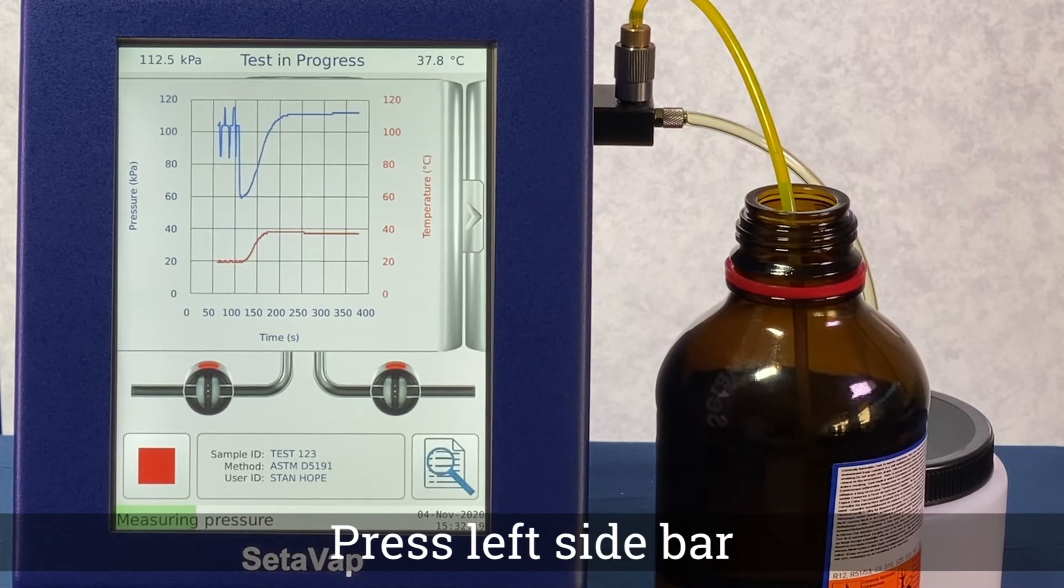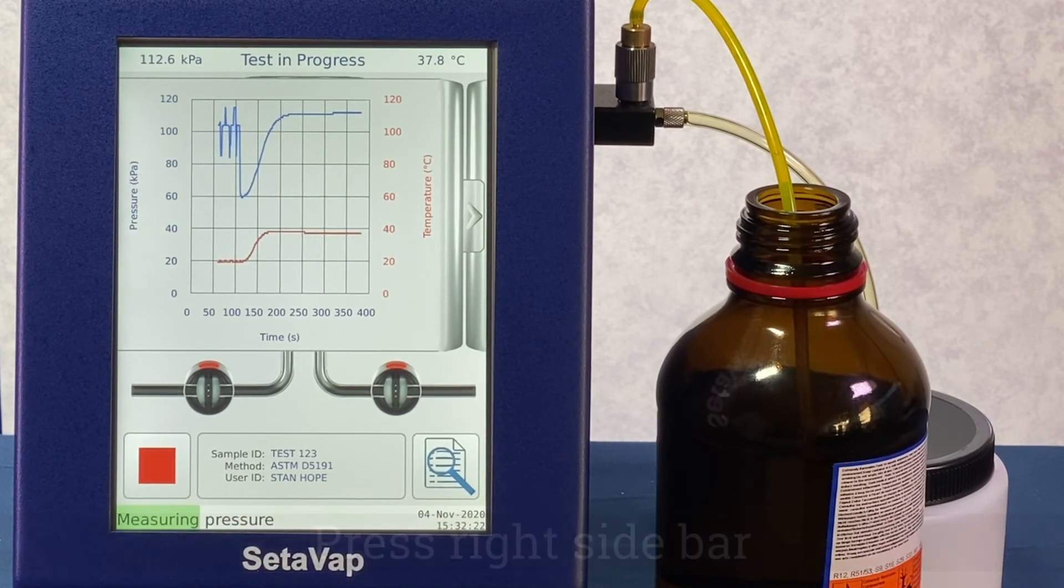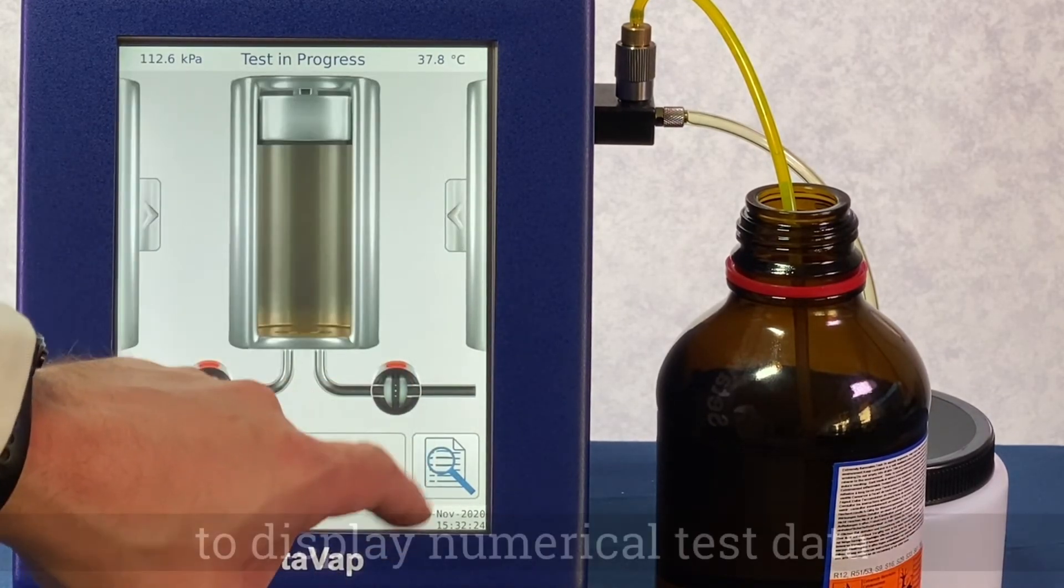During the test, pressing the left sidebar on the screen will display graphical test data and the right sidebar will display numerical test data.